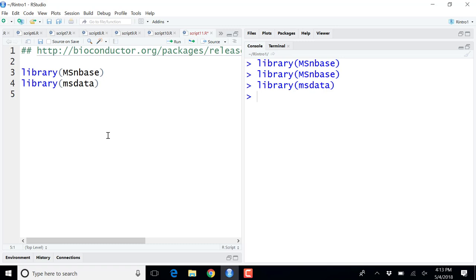When I talk about proteomics data, I think of raw data, that would be my mass spectrometry data. I could also be interested in identification data, or in quantitation data. When we talk about raw data, the file format would be mzML or mzXML, or one of these open formats that are available. So this would not work with the proprietary binary formats that are produced by the instruments. You need special libraries for this. But all the open formats that can be generated by MSConvert, for example, would work here.